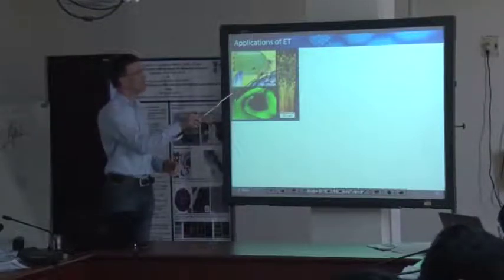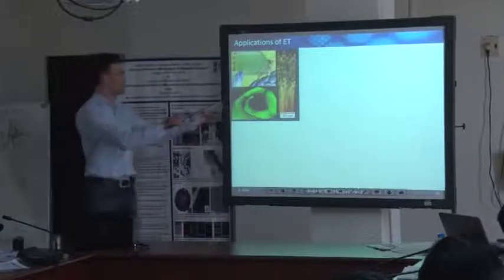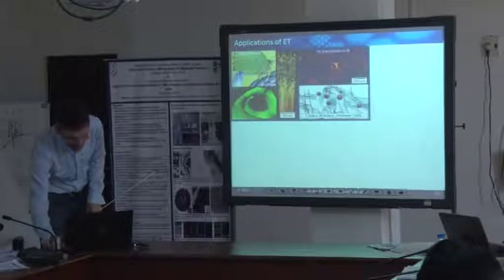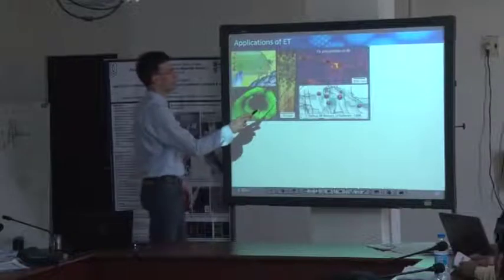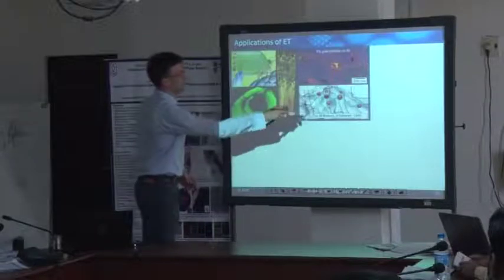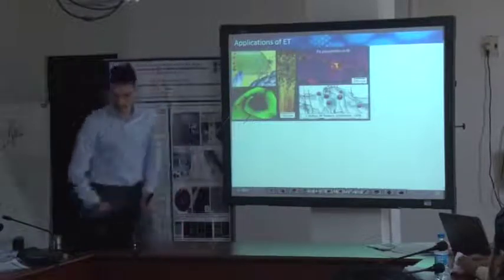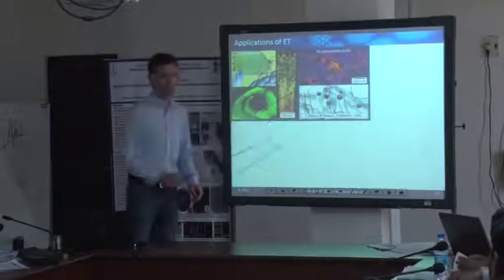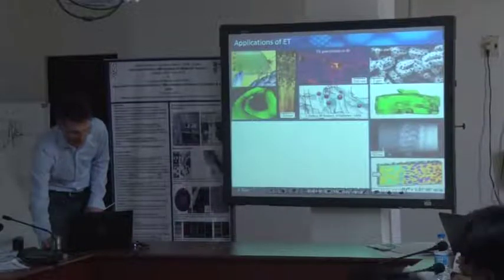These are scales of butterfly wings. We prepared them for TEM. And this is just the final distribution of the chitin that causes this green color in this particular case. The second example is from Berkeley National Lab. And these are dislocations in some particles, lead particles or precipitates in aluminum. You see a really dense dislocation microstructure. And this is the three-dimensional distribution of this dislocation network within our sample. So you can not only apply that to defect-free materials. These are two examples.